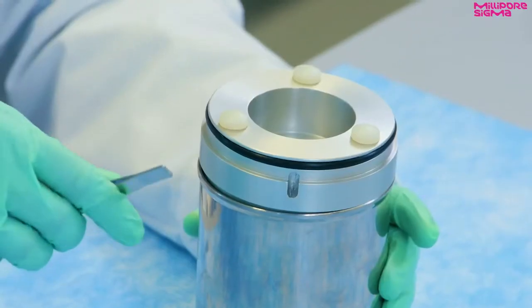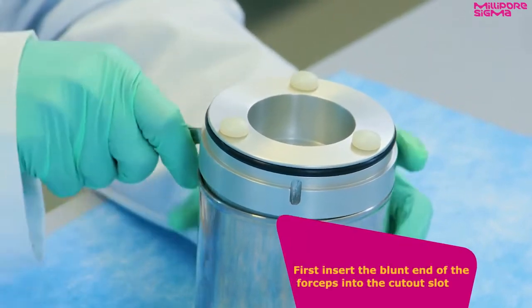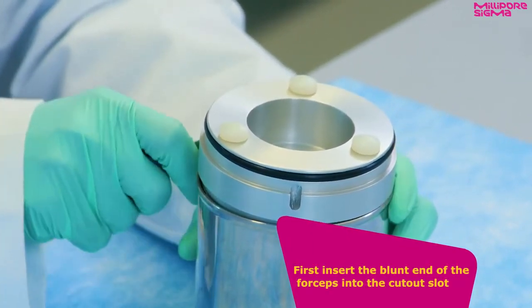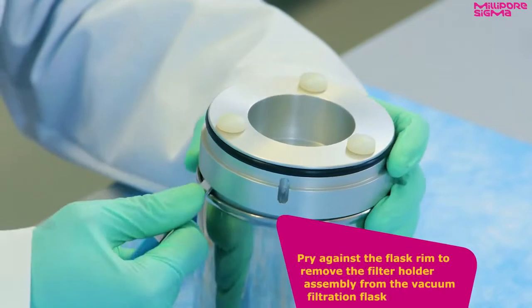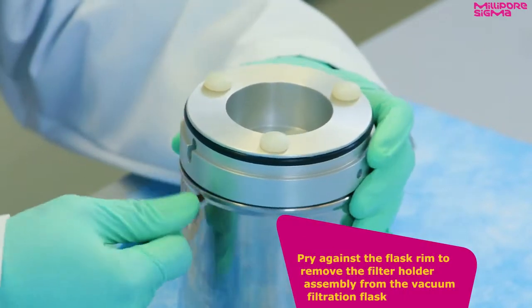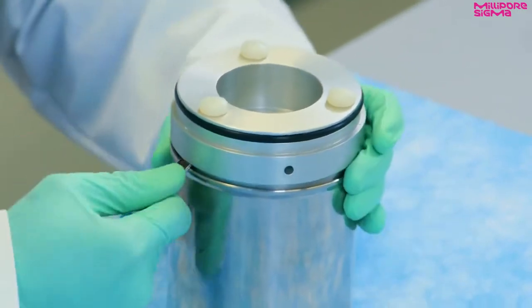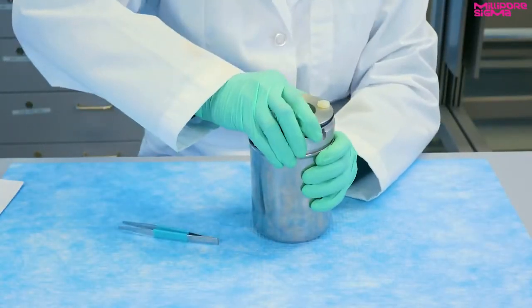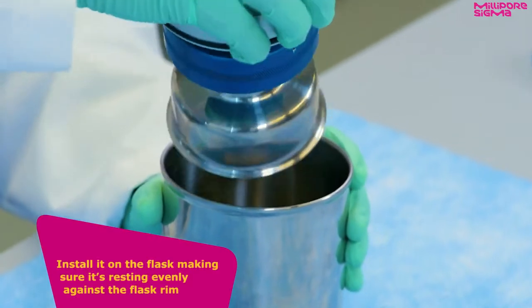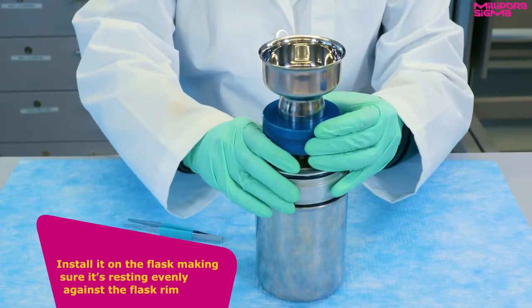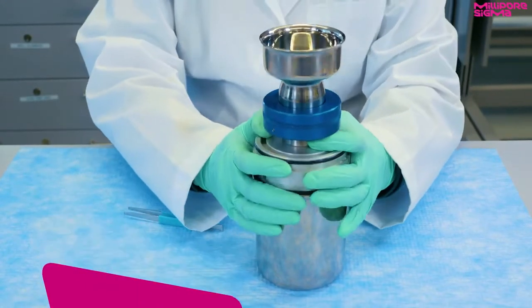To assemble the test filtration apparatus, first insert the blunt end of the forceps into the cutout slot and pry against the flask rim to remove the filter holder assembly from the vacuum filtration flask. Remove and invert the holder assembly and install it on the flask, making sure it's resting evenly against the flask rim.